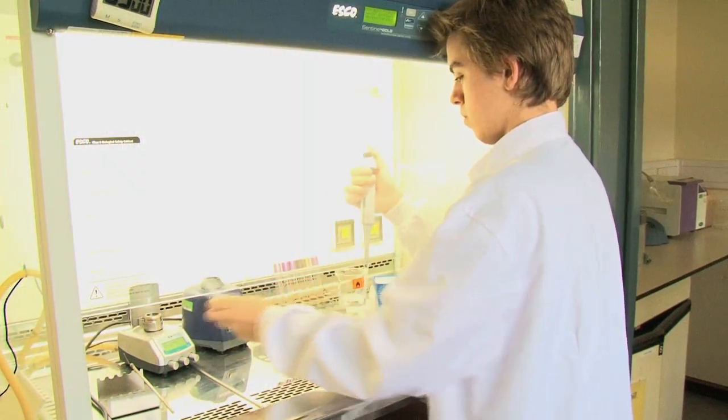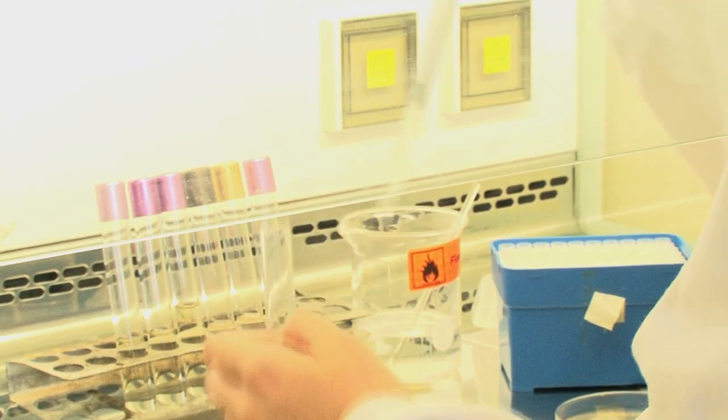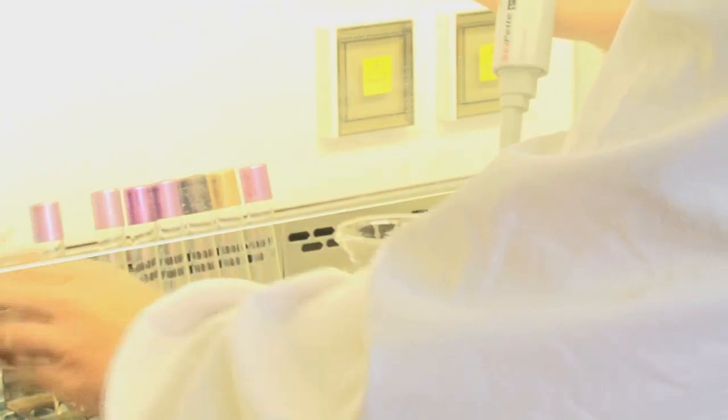We've been using some high-powered lab disinfectants, so we've used Virkon, which breaks down and releases oxygen, which breaks down the cells of the fungi.